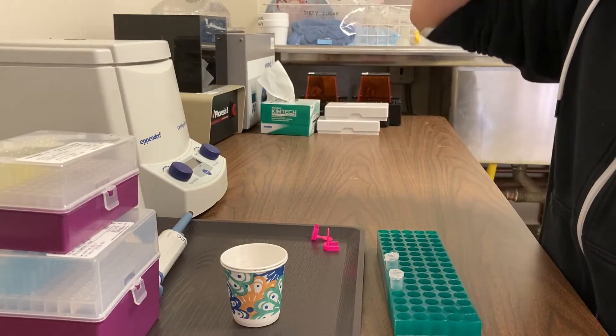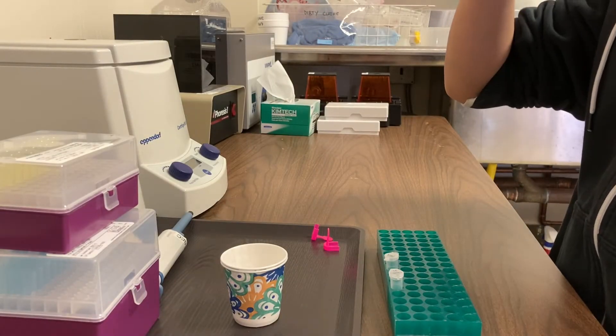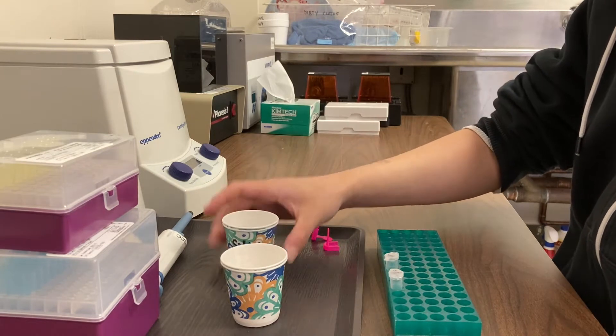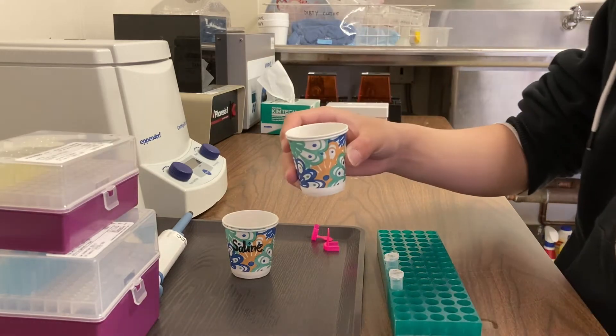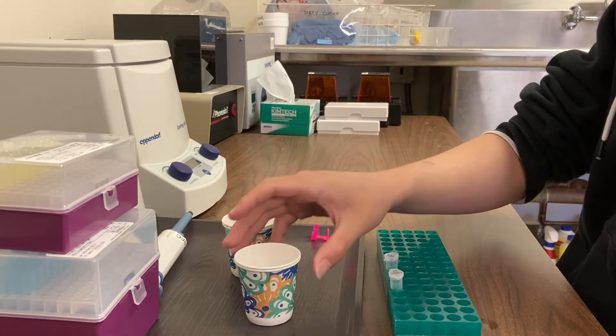We begin by taking 10 milliliters of saline, which is basically salt water, and swishing it around in your mouth for 45 seconds. You've got to get those cheek cells off of your cheeks and into the saline before you spit it back into the cup.